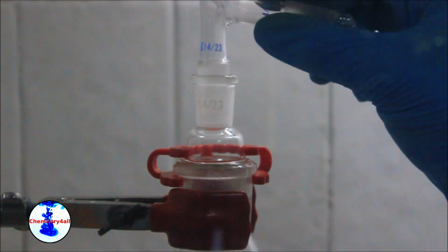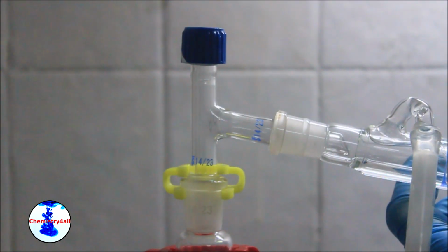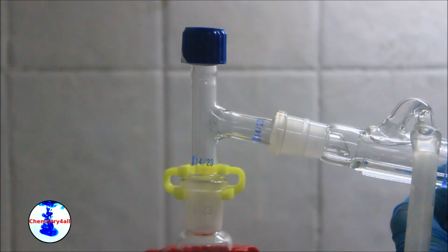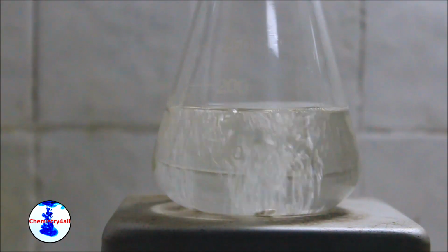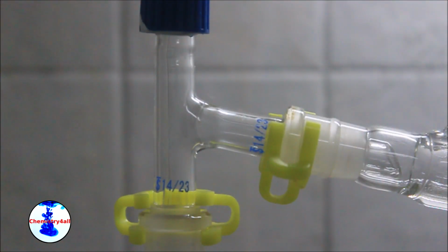Now we will isolate our product by means of simple distillation. A distillation head or T-head is then attached to the system. And finally, a simple condenser is attached to it. After a while, the vapors will reach the T-head and the condenser, and the first drops of distillate will start to be collected.